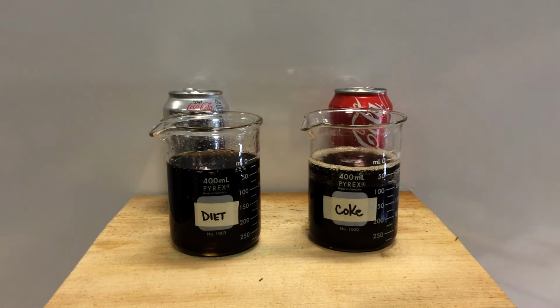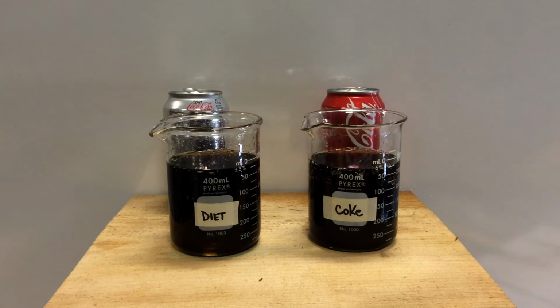Because in this lab, unlike our first density lab, we're dealing with measuring volume with a liquid. With a solid, we measured the dimensions with a ruler. Here we're going to need a graduated cylinder, and we're going to have some issues with the space being taken up by the gas. So we're going to let this go flat for a day or so and pick this up the next day.